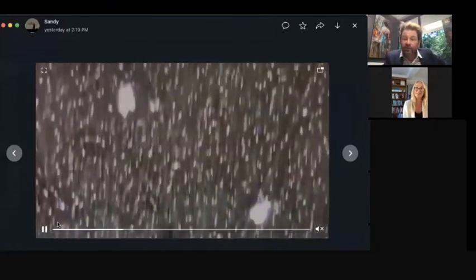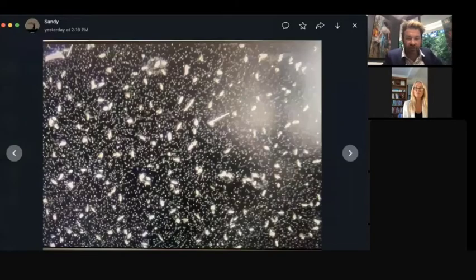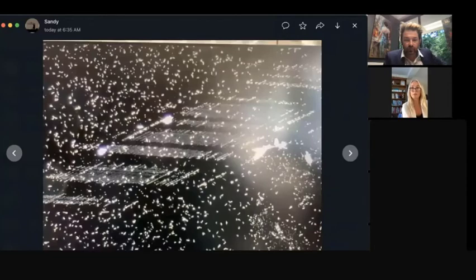And these formed after 3 hours of a drop just sitting on the slide. So you didn't shake it. This was the same slide that you did the images of before that looked like this. Yeah. And then 3 hours later, they look like this. I think this was this morning. So even more lines had formed the next day. I kept it overnight as well. And then, see, this came overnight. That structure.